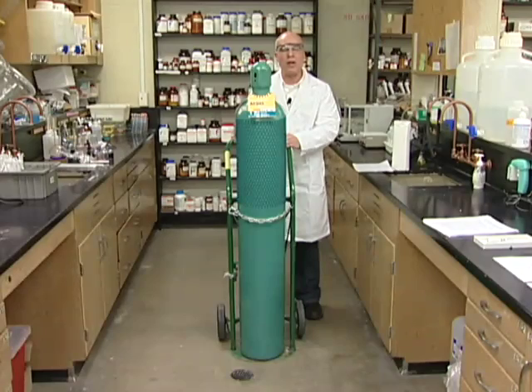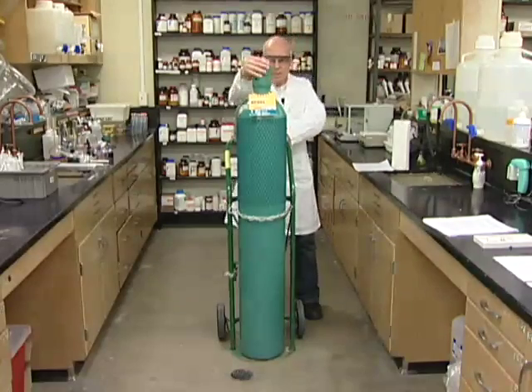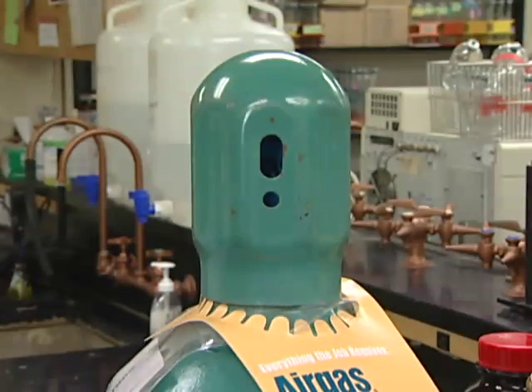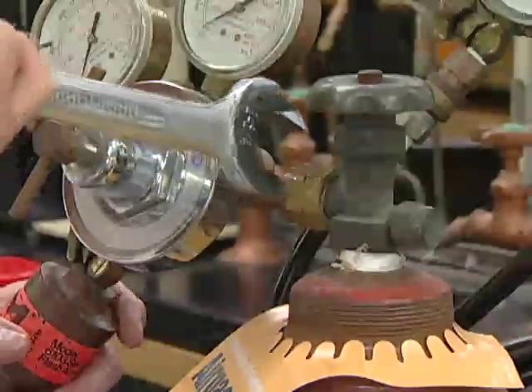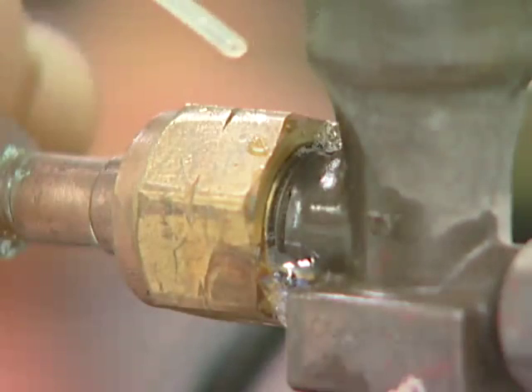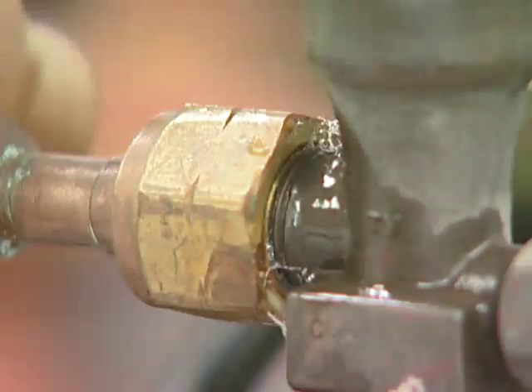Gas tanks are safe to work with as long as you follow a few simple precautions. Always use a tank cart to transport cylinders. Never move a tank without its cap on. The tank should be secured to the wall before removing the cap and attaching the regulator. Never use thread tape when attaching a regulator to a cylinder. Do a leak check with dilute soap solution — bubbles indicate an improperly sealed connection.